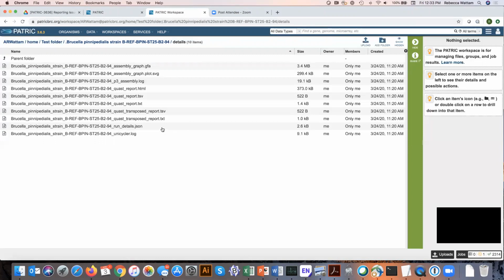This isn't recommended for you to view, it's for a computer to view, but it's here and you can look at it. We also provide the Unicycler log file for each time it's run. Once again, this isn't recommended for viewing, but it is downloadable and viewable. So this is the kind of information that's available with your assembly.